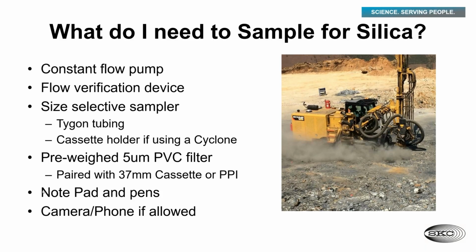Like, for example, if you took this picture and the individual that you were sampling is just downwind on the left of this, that tells a very telling story of where all that dust came from. So being able to incorporate pictures into your reports makes a world of difference when it comes to being able to understand and explain the results.